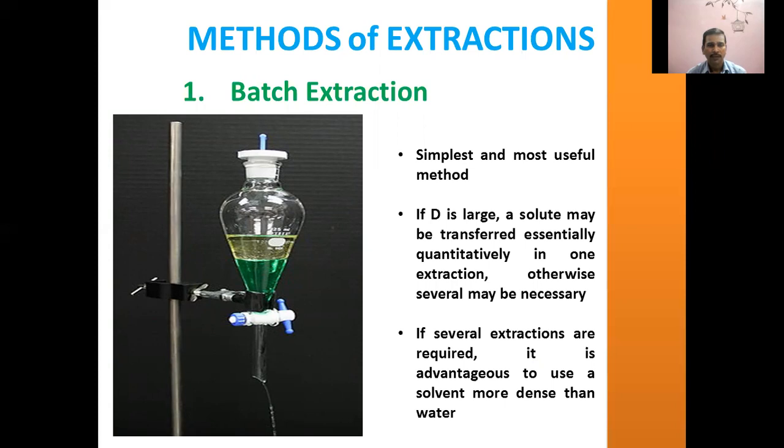In this standing time, both the layers, organic and aqueous, get separated. Then the lower layer is transferred to another container. Here the lower layer may be the organic layer or the aqueous layer, whichever it is, and that depends upon the density. If the organic solvent you are using is lighter than water, then the organic solvent will be at the top of the aqueous layer. If the organic solvent is denser than water, then the organic solvent will be at the bottom of the aqueous layer. Of course, you know this.